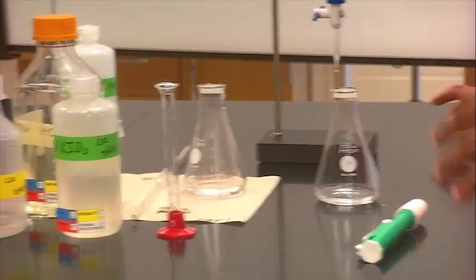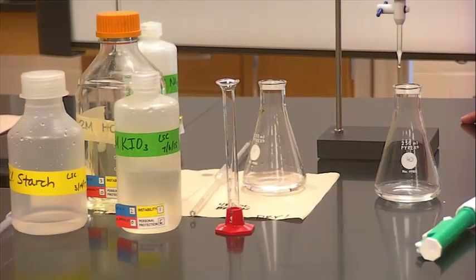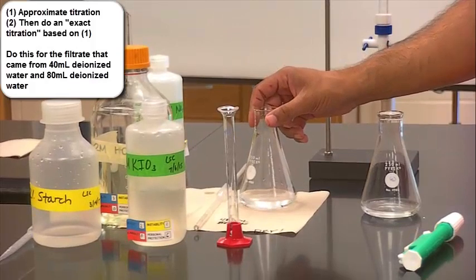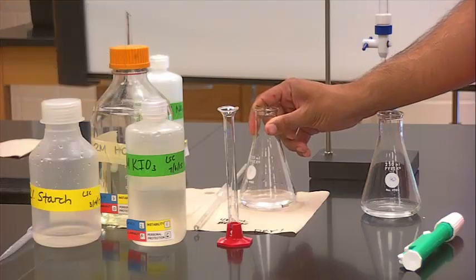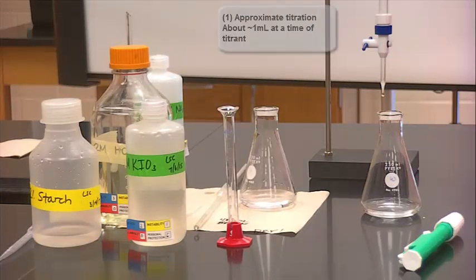So it's important here to realize that we are going to do 4 titrations here. We're going to do what is called an approximate titration, and then after that we will do what's called an exact titration. The approximate titration is when you will take about a mil at a time of your titrant until you get the color change.